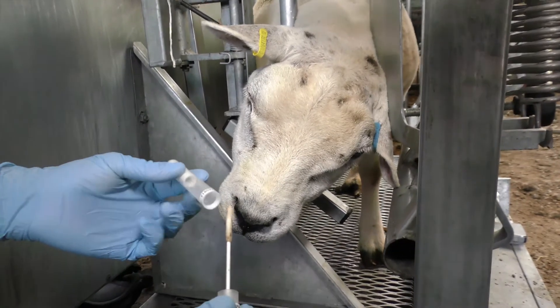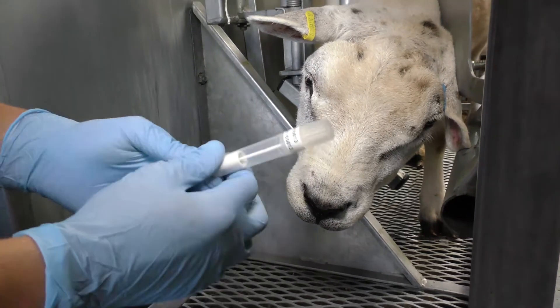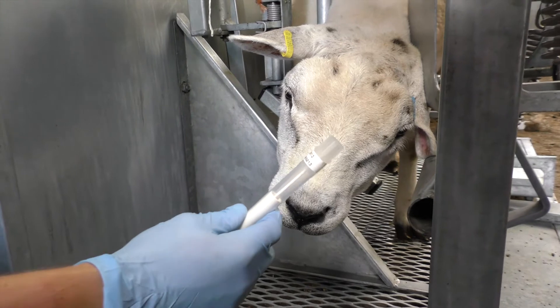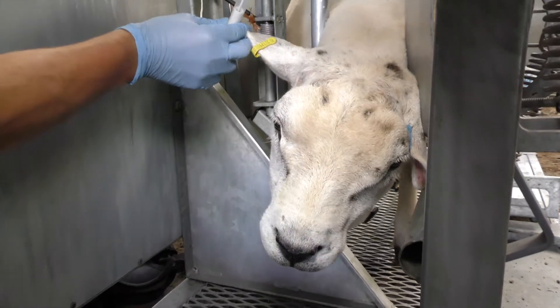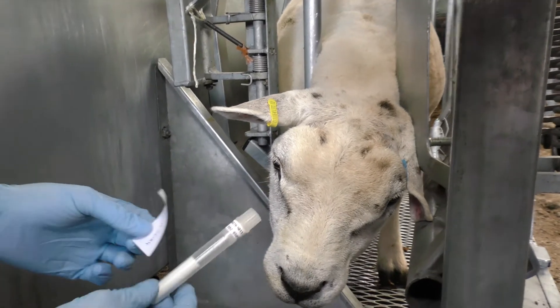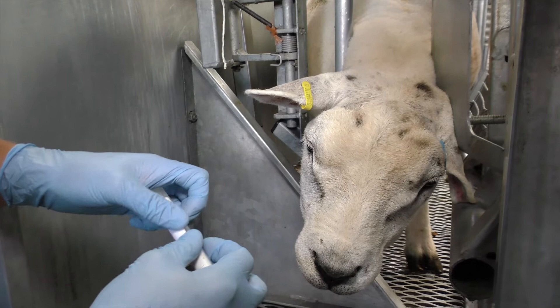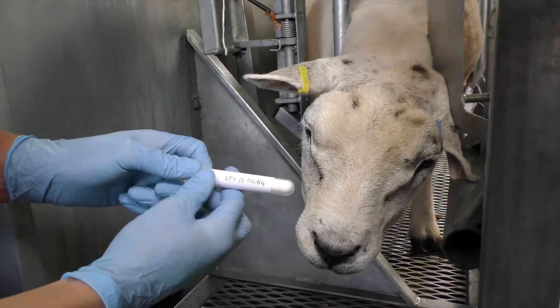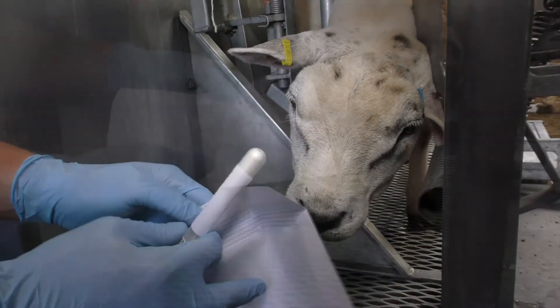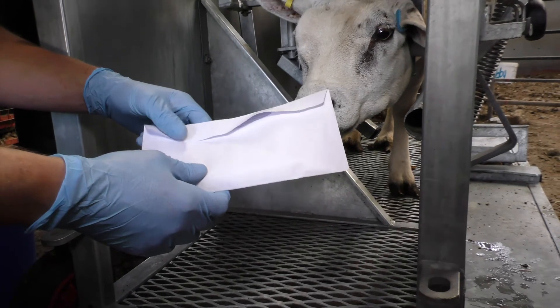We then pop the swab back in the tube so it's secure. We then check the animal's tag once more, apply a label and pop the label on the swab like that. We then put the swab in an envelope and send the envelope to the address printed on the envelope.